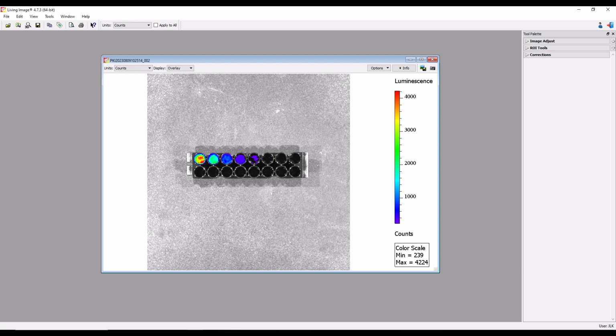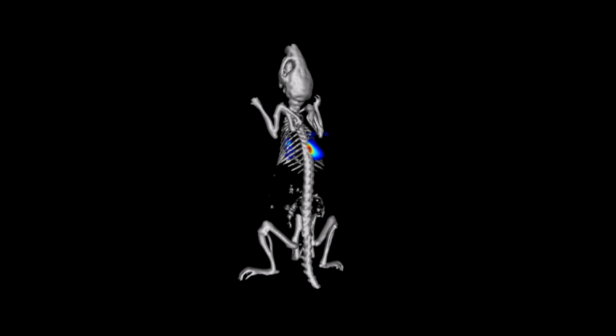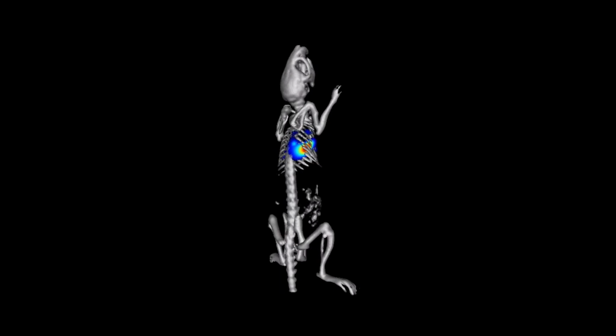Also ensure that you test their growth and viability and directly compare to the parental strain to elucidate the impact of any transfection on cells. Furthermore, such in vitro assessments of light output in transfected cells also offers valuable information on stability of light activity and potential in vivo sensitivity before you move into imaging live animals. Once these preliminary characterization studies are complete, you're now ready to move into the in vivo phase of your work to assess biological activity of your cells in live animals.